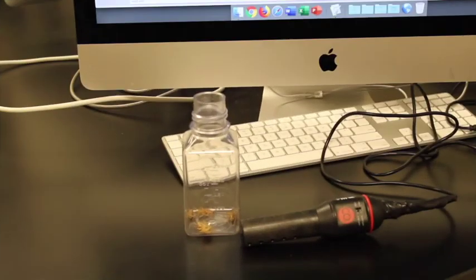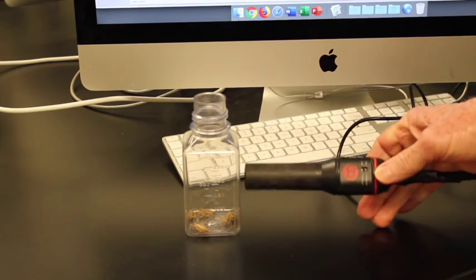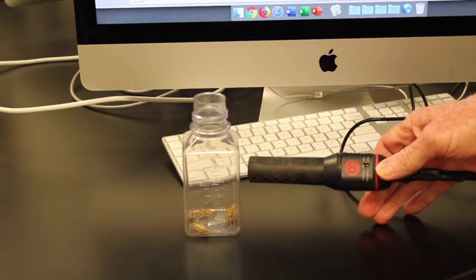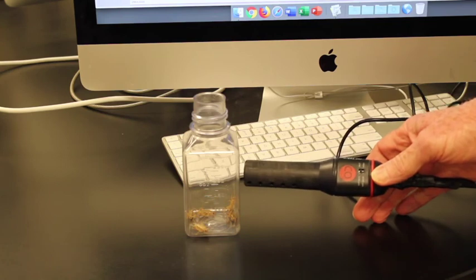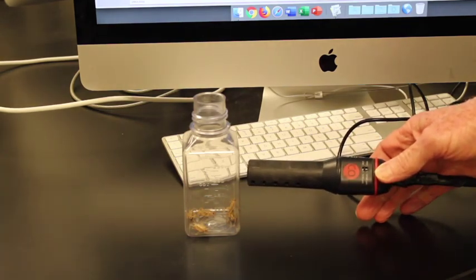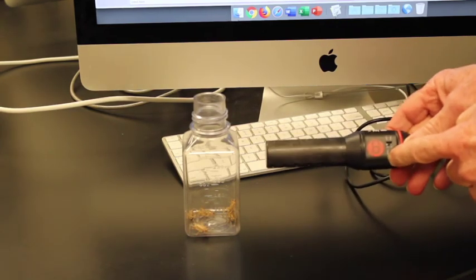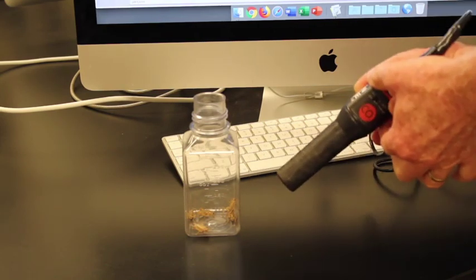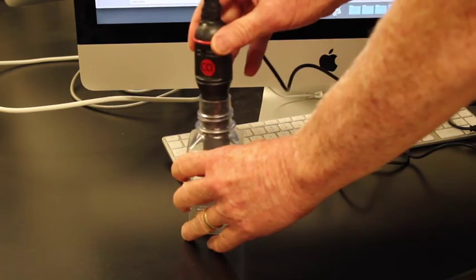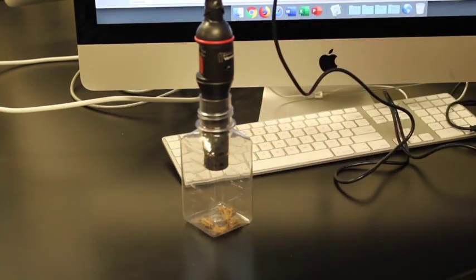So the next step then is to measure the respiration rate. In order to measure the respiration rate, we are going to need to measure the output of carbon dioxide. Okay, so respiration then is a process which gives out carbon dioxide. That carbon dioxide then can be measured by a carbon dioxide probe, which is going to measure the parts per million of carbon dioxide in the atmosphere. So I'm going to take this probe, put it into the chamber here. Okay, we'll make sure that it just stands up there.